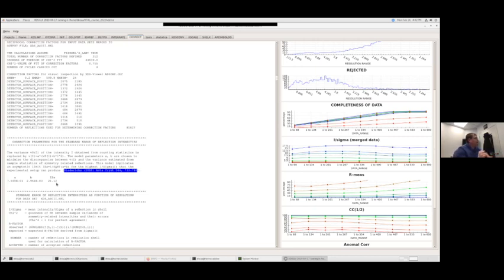So if you have a project that you worked on and you normally consistently get ISAs over 20, and then you go to a different beamline and it's giving you a much lower ISA, you might let the beamline know that, hey, something seems to be funny. I'm not sure if it's your beamline or not, but I'm getting a worse statistic on your beamline than I normally get. But in general, the other thing that can cause this is just weak or poorly diffracting crystals.